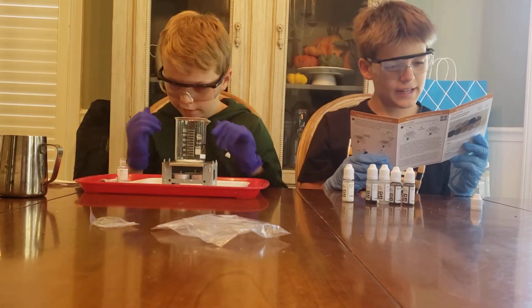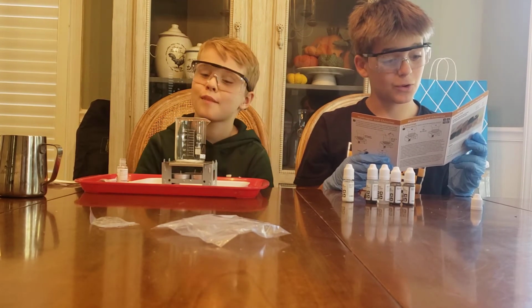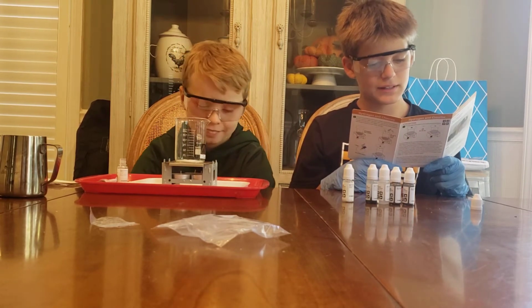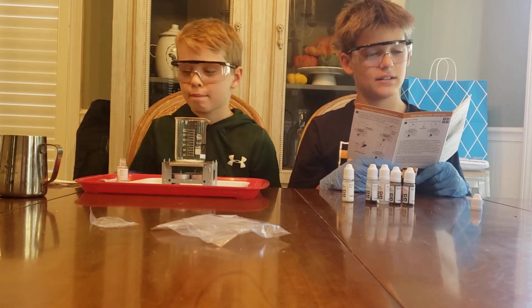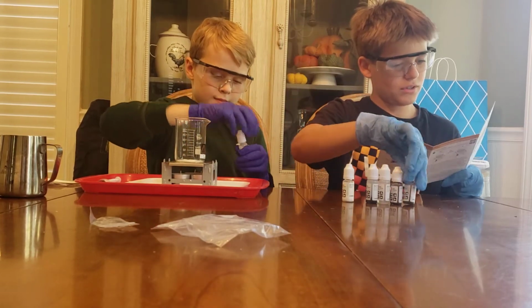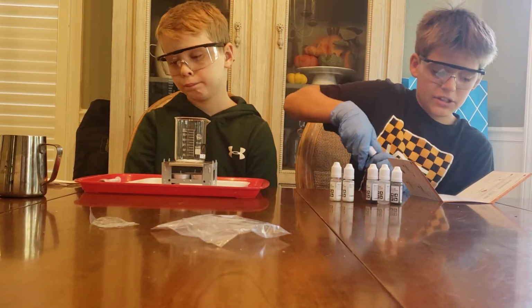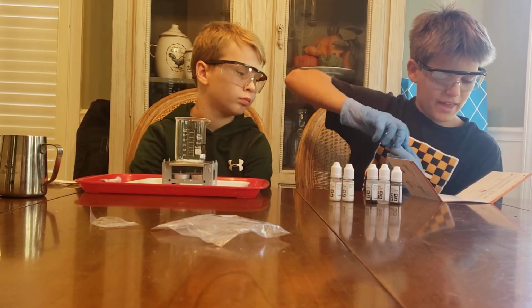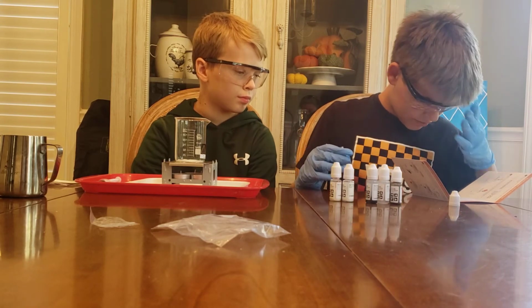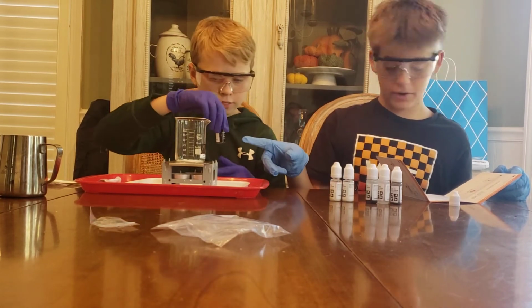Step 3, oh my god, I hate this word. Hydrochloric acid, HCl, in turn can react with manganese dioxide, MnO2, to produce chlorine, Cl2. To produce HCl and make it react with MnO2, you need to dissolve the reagents in water. Okay? Put the whole bottle into this.